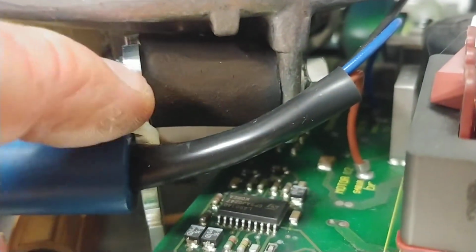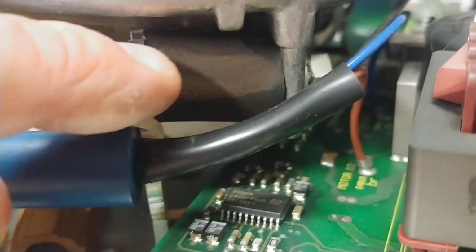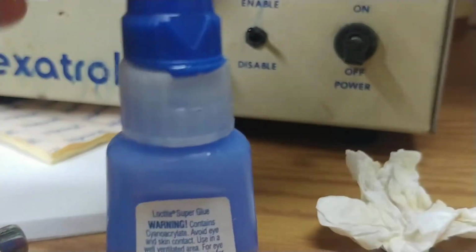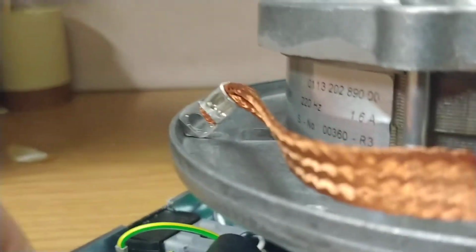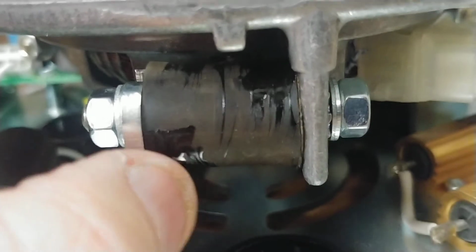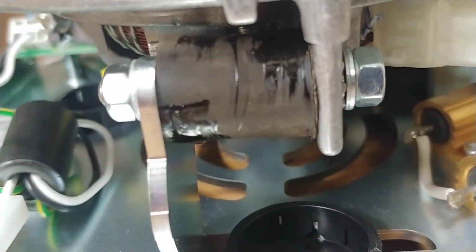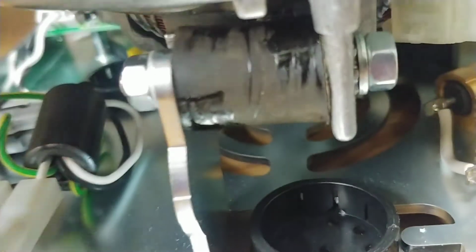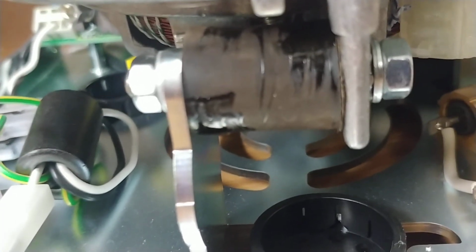I suppose you can hunt down brand new ones, but in a pinch you can get it fixed the same day, get it back out into service, possibly with the MacGyver tube of super glue. Now I'm letting it harden in place because in its new position the rubber is compressing the glue here, and up there it's squeezing the tear together naturally. So I don't need to make a special jig to compress that rubber while the glue is curing.